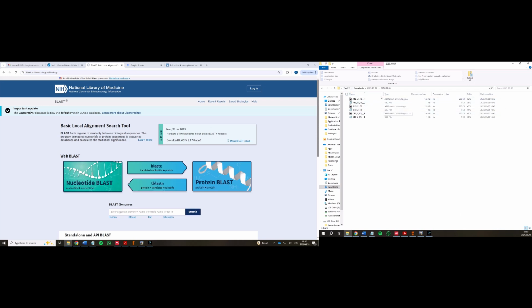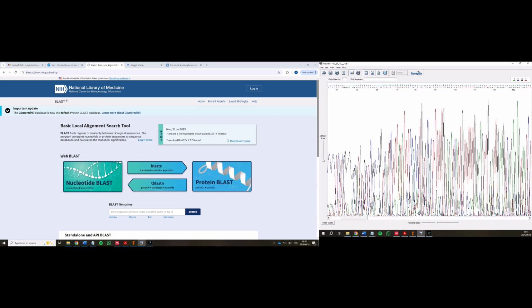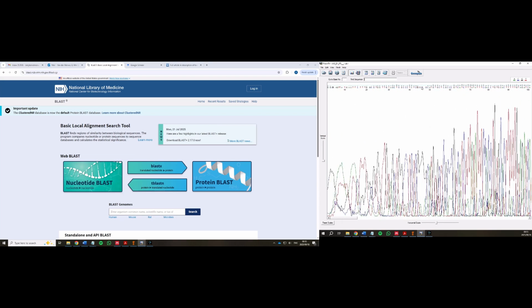Okay, this is a quick touch on how to analyze sequences from SAF. This is what the documents will look like. You open that folder. You need FinchTV to read the folder, so make sure you download that. It is free. Okay, first we need to trim off the ambiguous bases on the ends of the sequences.